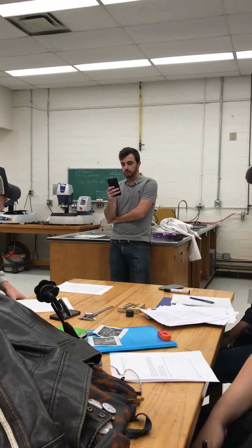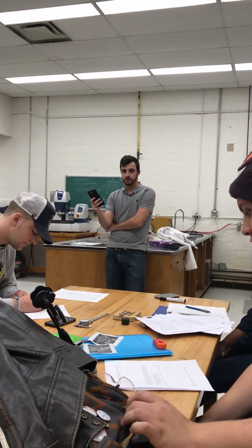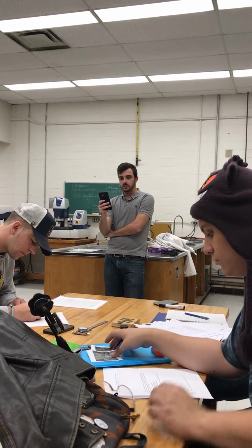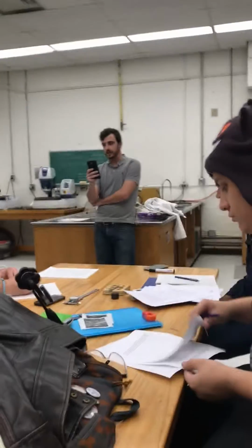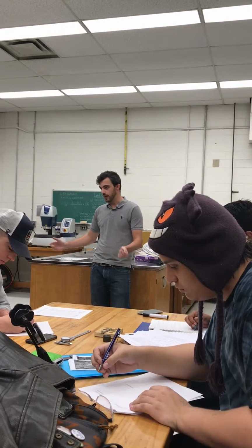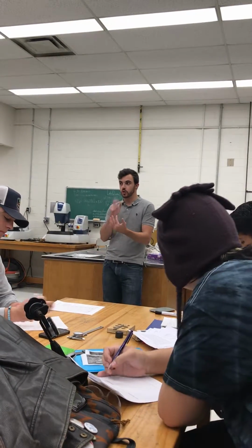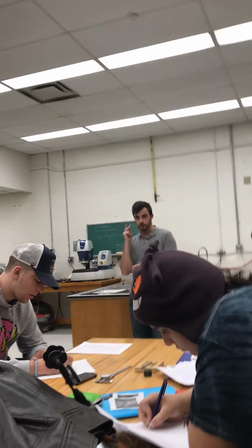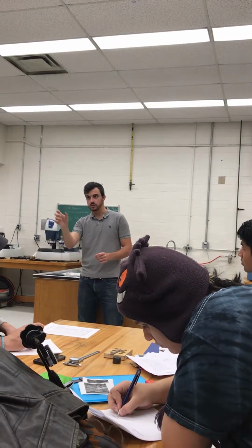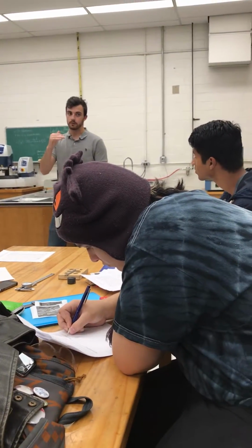Now for labeling pertinent features of the cold worked and annealed microstructures. So you've got your micrographs. Everybody should have their micrographs at this point, correct? Okay, good. I want you in the additional observations to identify magnification level. Based on what I've seen from other lab groups, everybody had a hard time understanding. I need you to write 500 for each additional observation, so you should write 500 twice. Does that make sense? 500 under each additional observation section, so that I know that you used 500 times magnification for each micrograph.